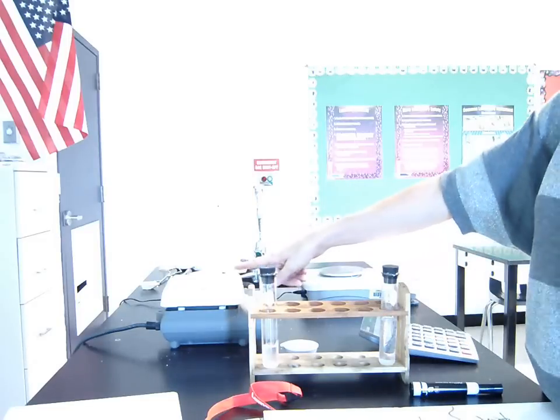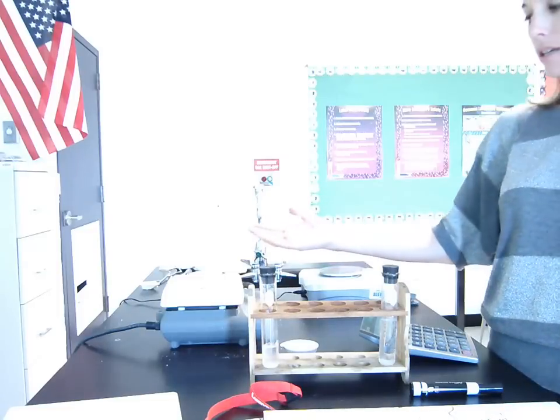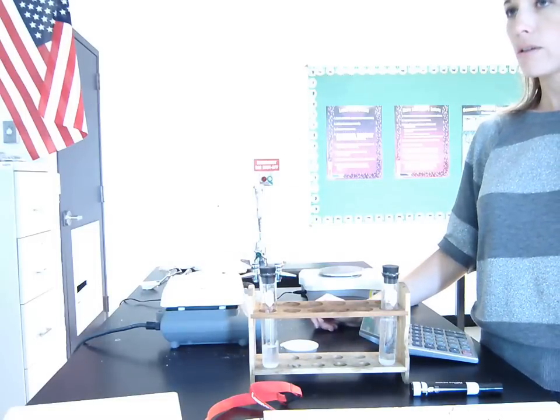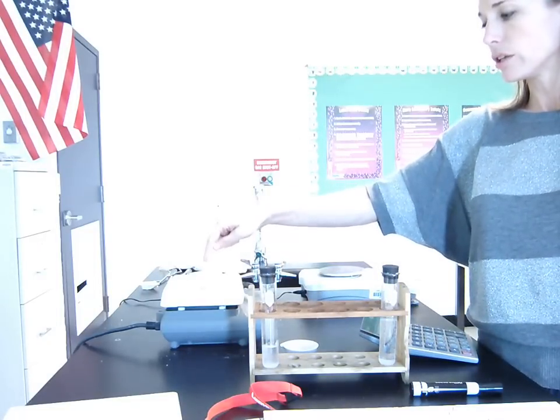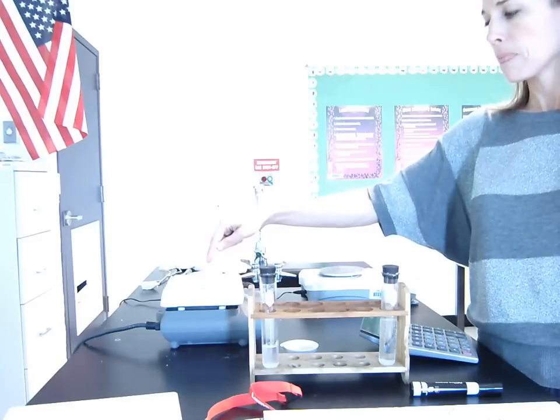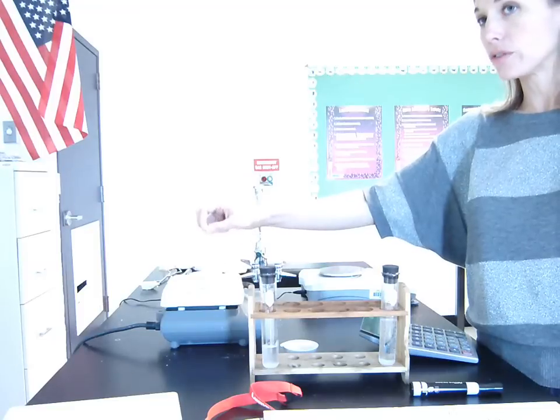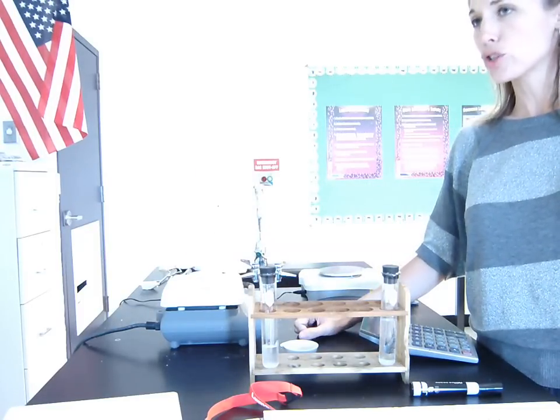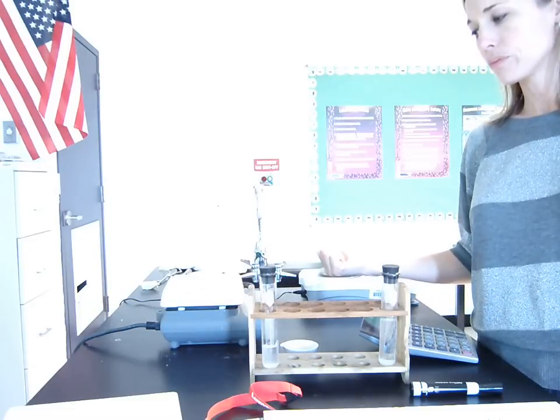What I'm going to do is let all of the water boil off, so that I'm essentially taking the water out, and I'm going to have the solid left over. So right now, whatever solid is actually dissolved in that liquid, we can't see it because it's dissolved in the liquid. So as soon as we get rid of all the liquid, we'll be able to see exactly how much solid is in there. And then we can mass that and kind of go from there.